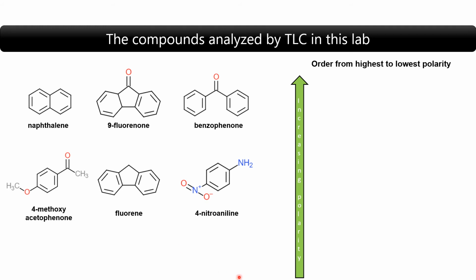And like we mentioned earlier, the solvent system used for the lab today is going to be 10% ethyl acetate and 90% hexane.